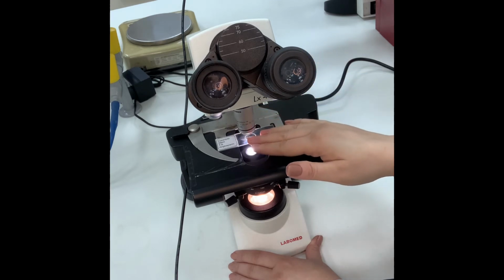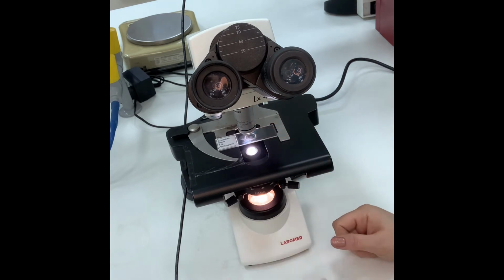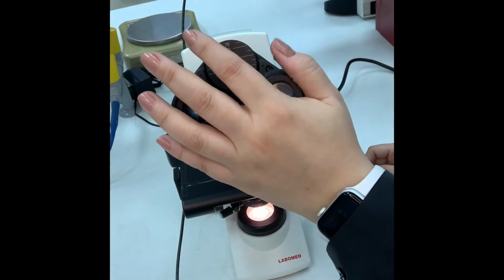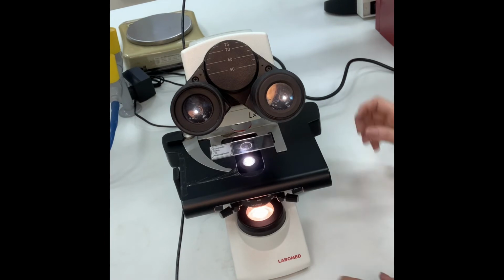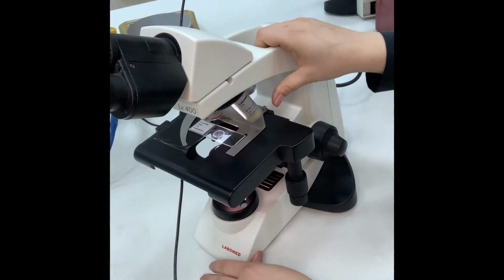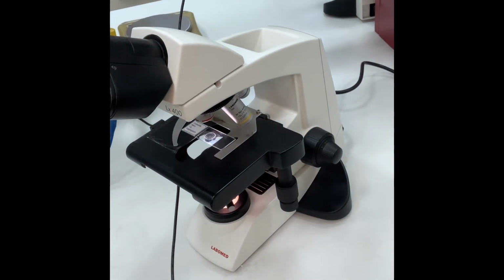Now, because I didn't fix the slide itself, I will show you my point now. I have fixed the image and I can see it under objective 4x. Now I need you to look, I will show it to you.